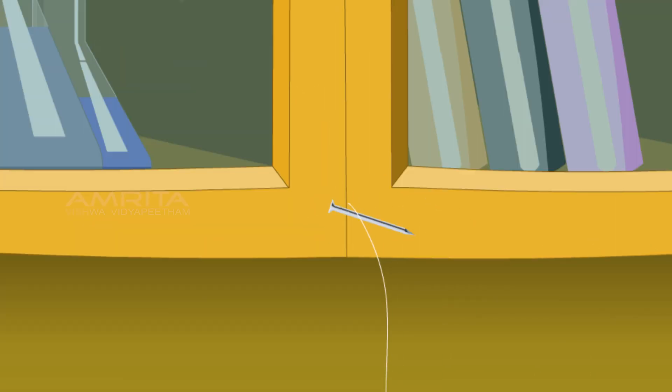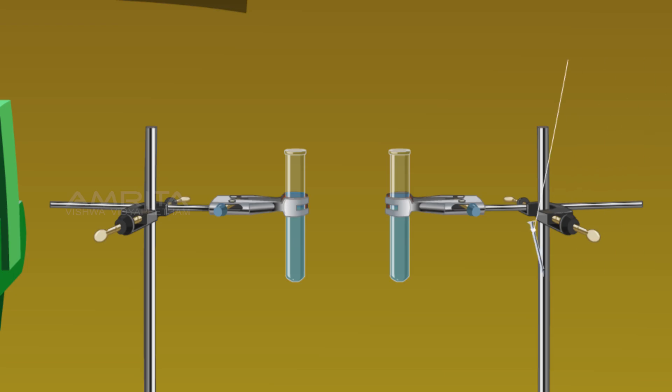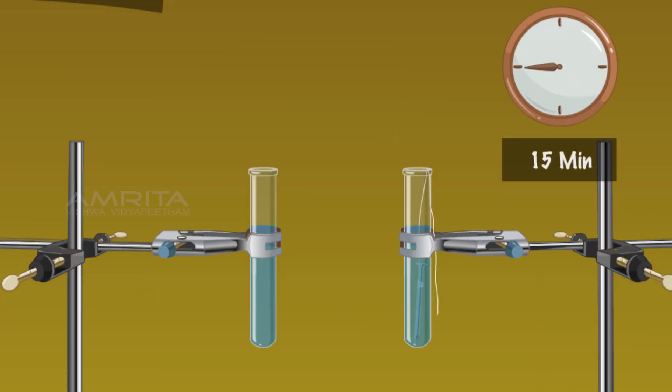Tie one nail with a thread. Immerse this into one of the test tubes containing copper sulphate solution. Keep the two test tubes undisturbed for about 15 minutes.